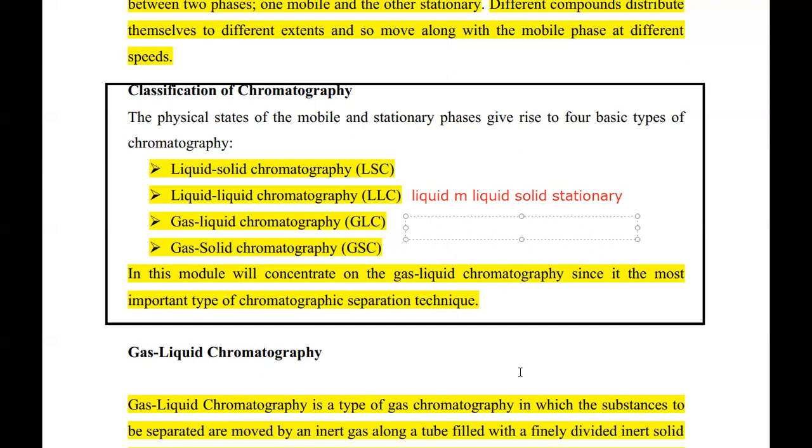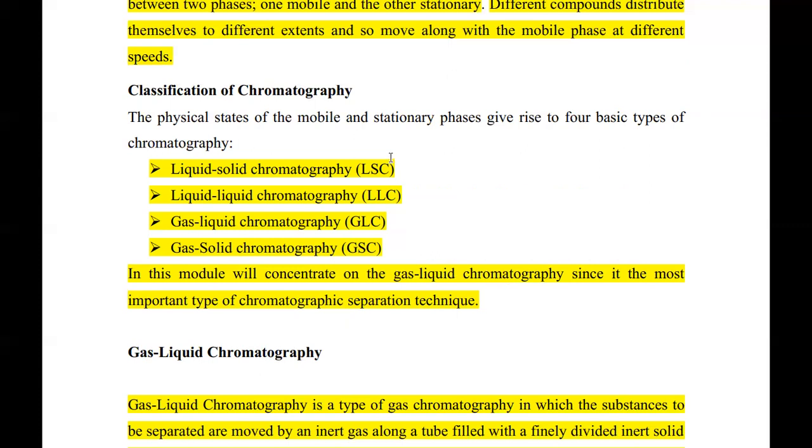But by the way, this thing here will also be classified into other types. Liquid solid, the one that I was just drawing here, where we had 2 samples A and B, then we had the solvent, the beaker being covered on top.